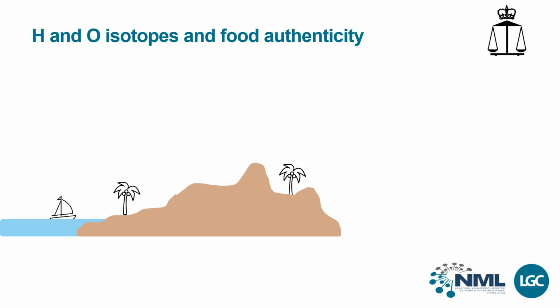Isotope ratios of hydrogen and oxygen can also be used to obtain geographical information for food and other biological materials. Looking at hydrogen and noting that the primary source of all organic hydrogen is the hydrosphere, the hydrogen isotope delta of the surface water of the oceans is constant and is approximately 0 per mil.